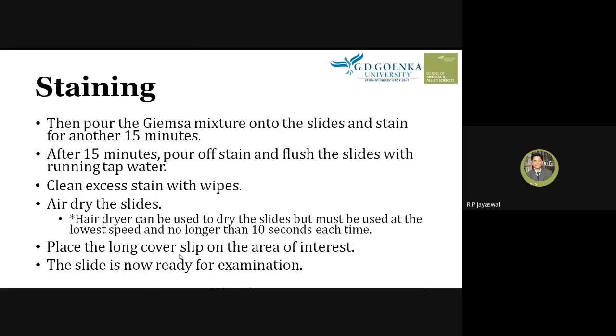This cover slip is usually kept to prevent attachment of dust particles to the smear. You can also use DPX so that you can prepare a permanent slide. First of all, you put the DPX, and then you put the cover slip, and the slide becomes permanent. When it dries, you can examine it under the microscope with the oil immersion objective.